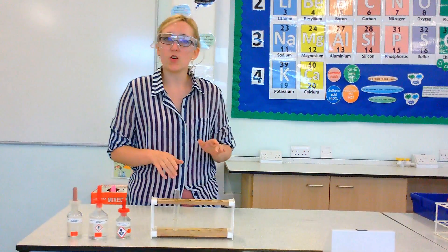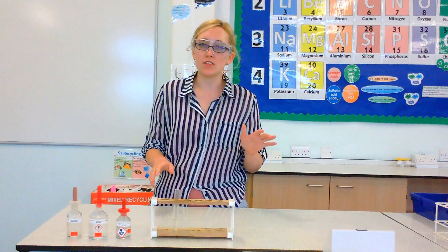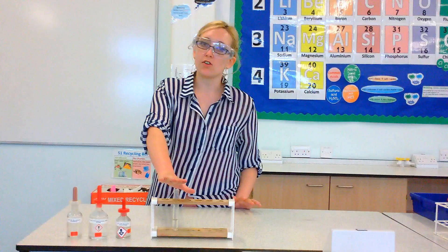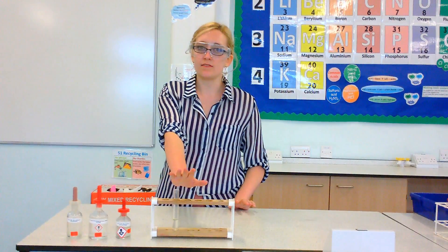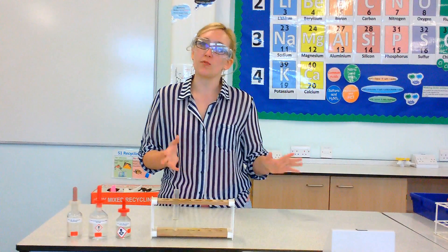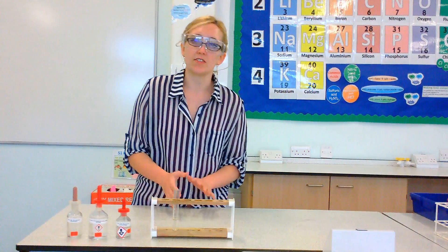Hello everyone. In this video we're going to be testing for negative sulfate ions. In this test tube here I've already got some sodium sulfate. Now you won't necessarily know what you've got in your test tube, but I'm going to show you the positive result if you do indeed have a sulfate in there.